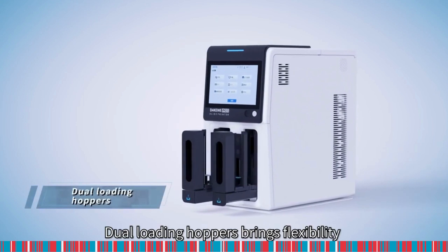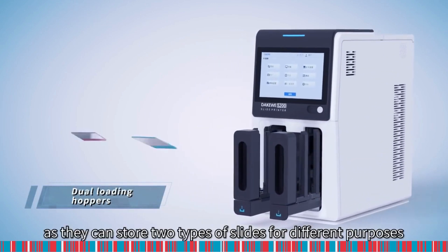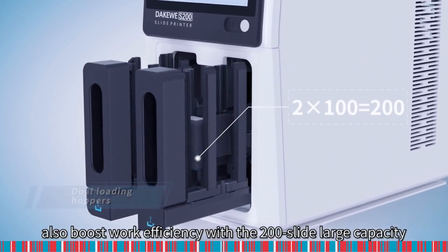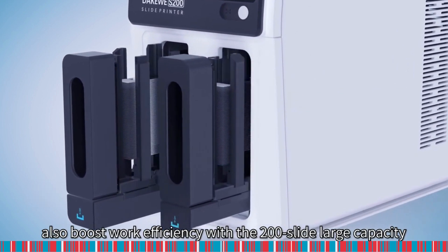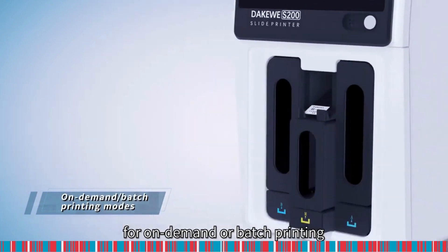Dual loading hoppers bring flexibility as they can store two types of slides for different purposes. Also boost work efficiency with a 200-slide large capacity. Comes with two separate outputs for on-demand or batch printing.